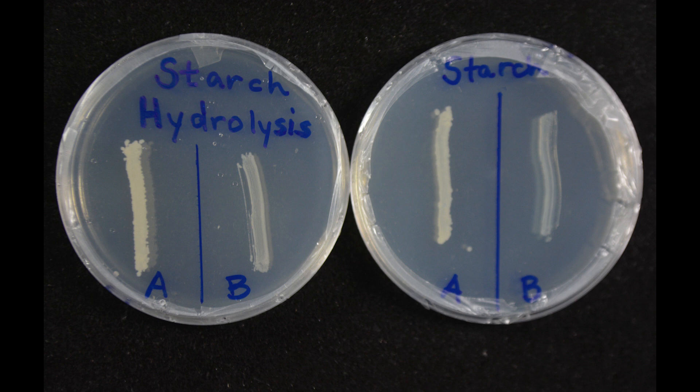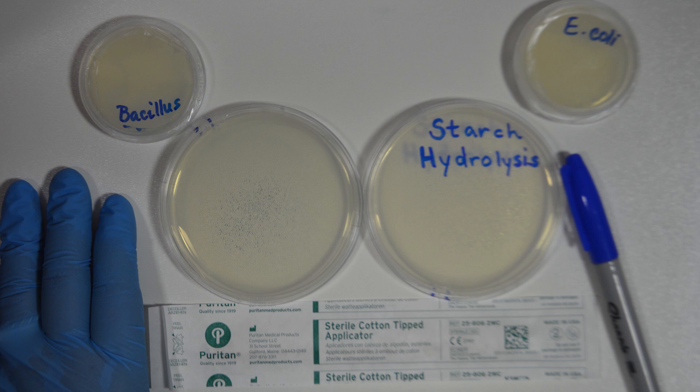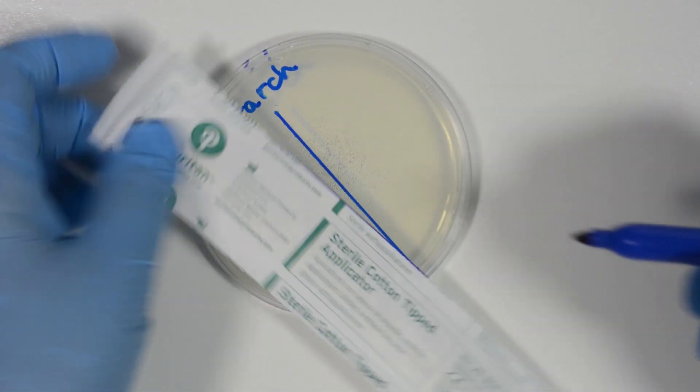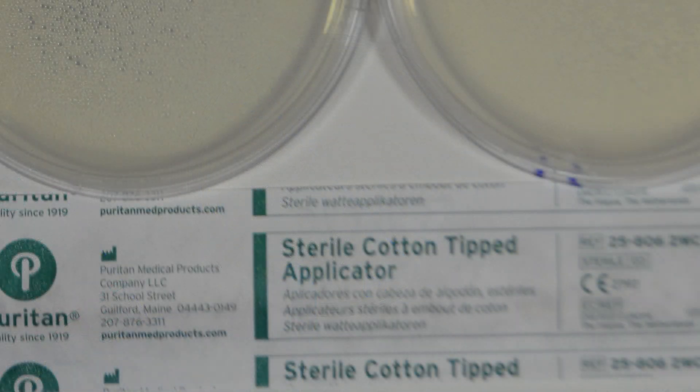The bacteria to be tested is inoculated in a single streak down the plate. We are going to use two bacteria and just one plate, so we will place two straight streaks, each one about a quarter of the way across the plate. First, mark a line to divide the plate into two halves and then label the plate. We are going to use sterile cotton swabs for this setup.